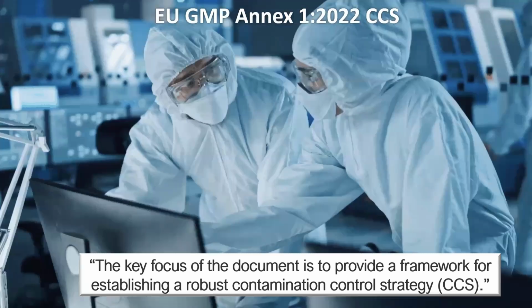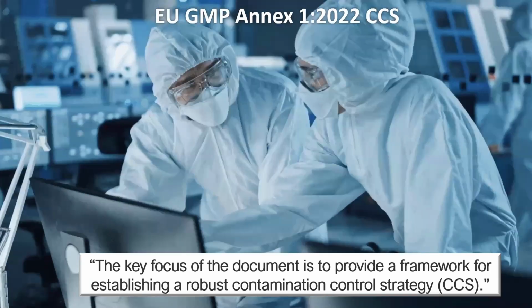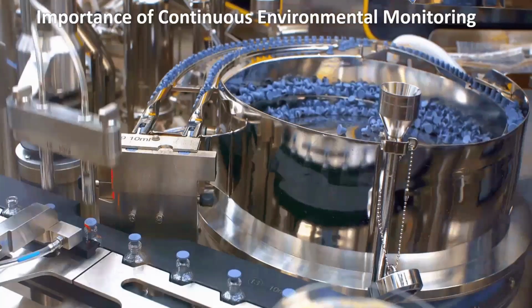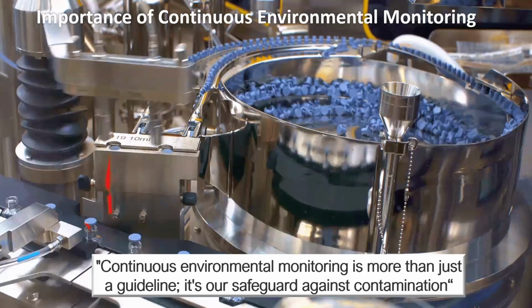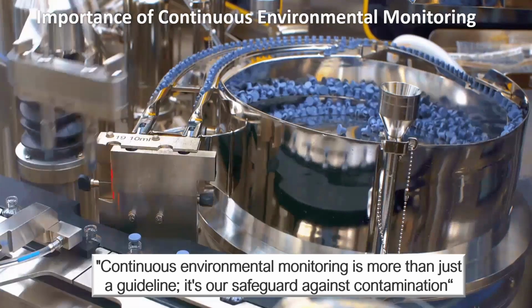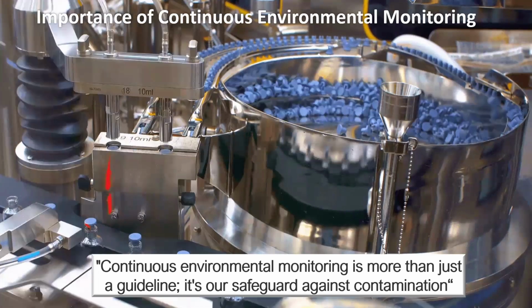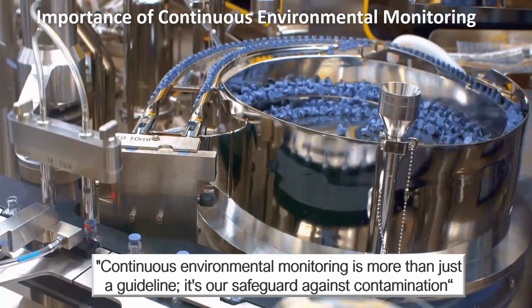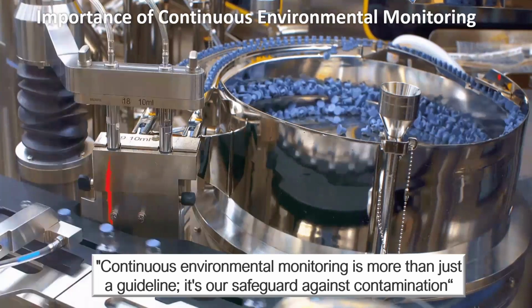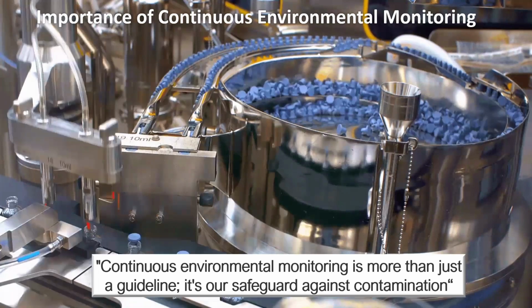With digital data, companies can adopt a more efficient, automated, and error-resistant process, reducing the risk of contamination and enhancing overall product quality. So continuous environmental monitoring is no longer optional, it's a necessity. By monitoring for viable and non-viable particles consistently, we're not just catching contamination events, we're preventing them. This proactive stance is crucial for patient safety and product quality. And continuous environmental monitoring is more than just a guidance, it's our safeguard against contamination.